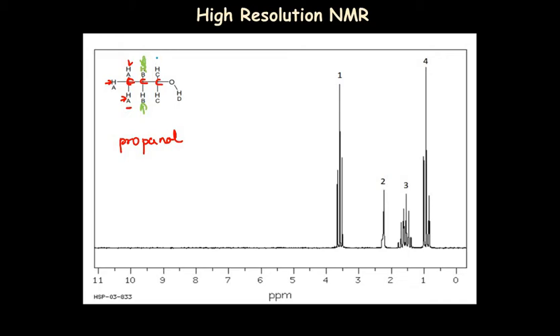Next, we have the C type of hydrogen, labeled C. These two hydrogens are again in the same environment, as I have described for the A and B types of hydrogen. The fourth type is the hydrogen bonded to oxygen in the alcohol group, which is again of a different kind.